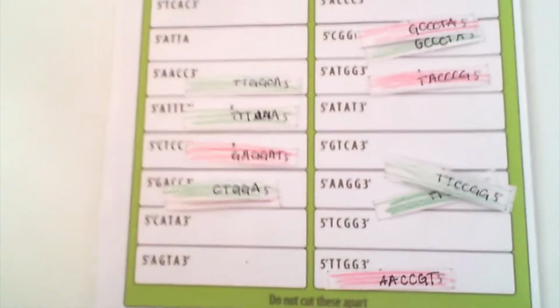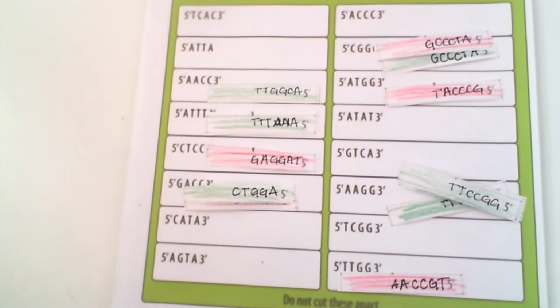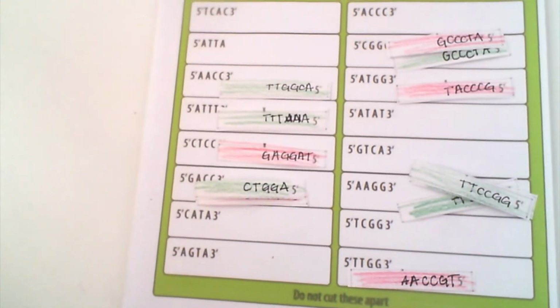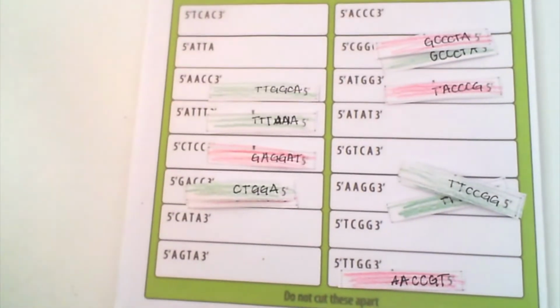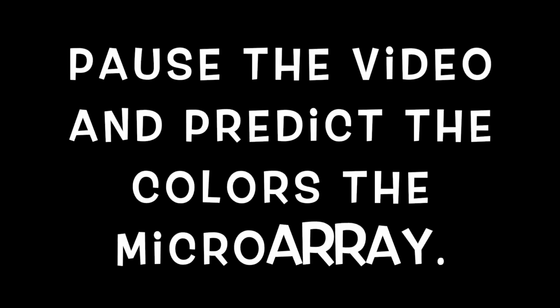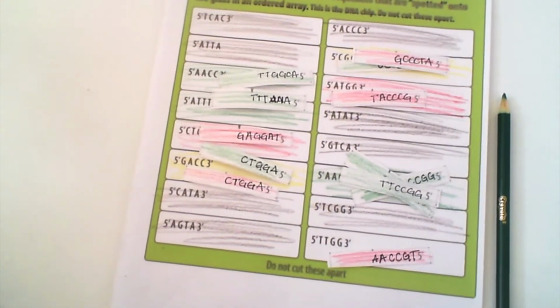So, predict what color this microarray chart will fluorescently shine due to the cDNAs that were popped up on here. Pause the video. A few moments later. So here's how the microarray will shine given the fluorescent light.